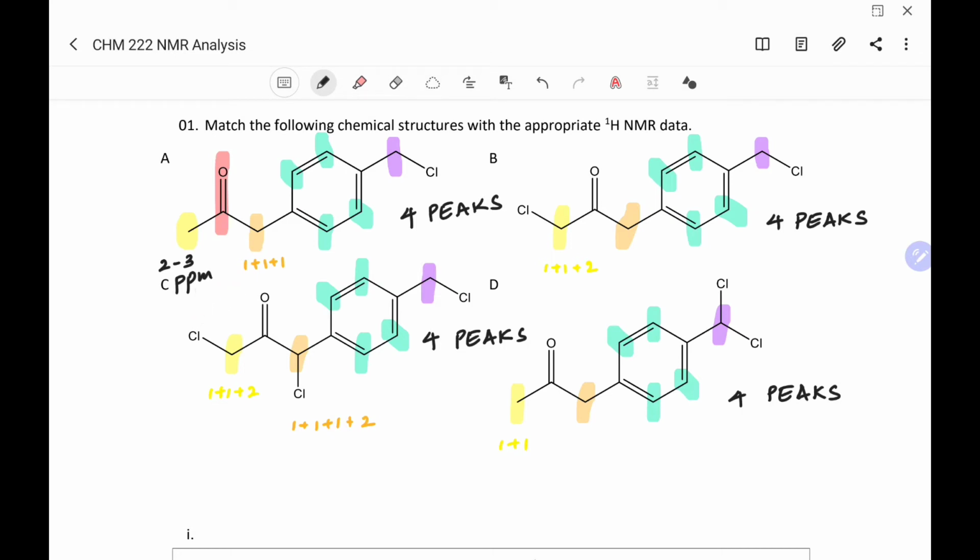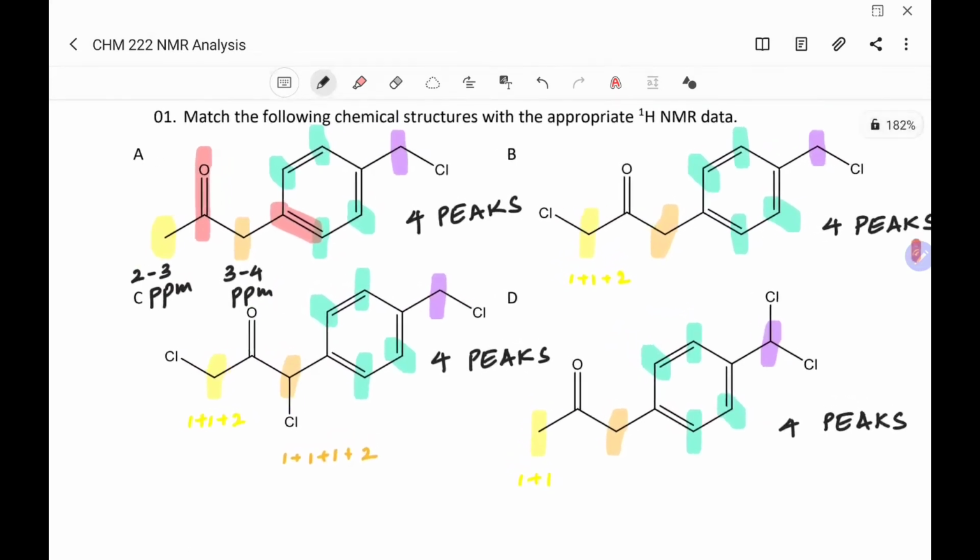And then the orange hydrogens. So basically it should be around 1 ppm. Okay, but you have a vinylic group, actually 2 vinylic groups. You basically have 2 vinylic groups next to each other. So therefore you expect, each vinylic group will add how much? +1, right? So this will be 1 plus 1 plus 1. So the chemical shift should be around 3 to 4 ppm.